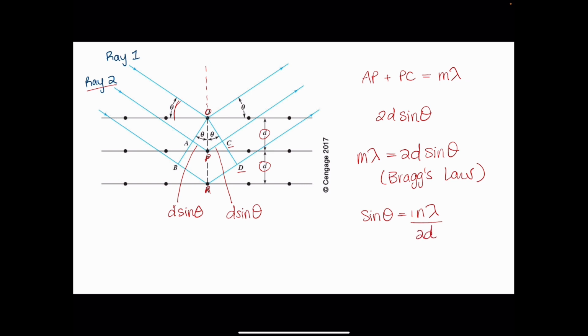Sorry, I'm getting confused with the textbook. At all other angles, destructive interference occurs, and you do not get that wavelength to be reflected. But in order to cover a useful analytical range of X-ray wavelengths, you're going to need a few different crystals available with different lattice spacings in order to be able to pick and choose those different wavelengths.